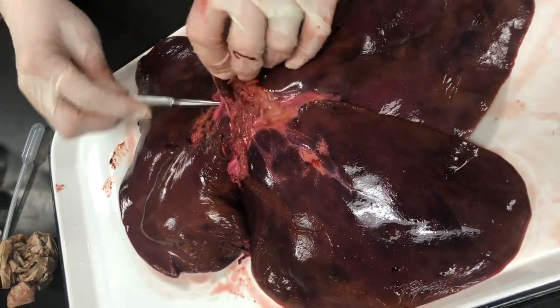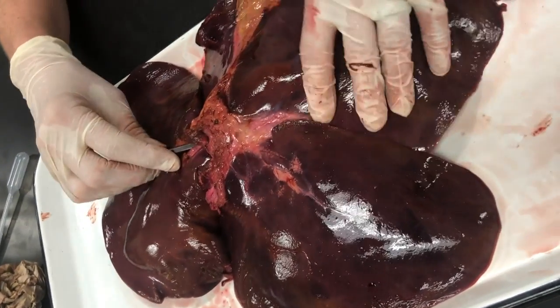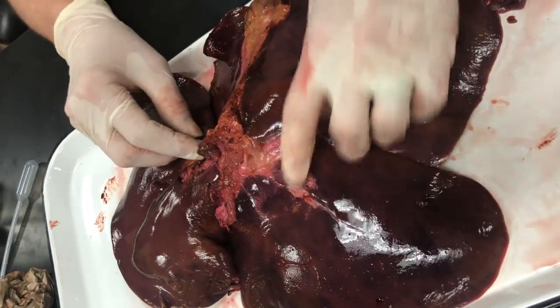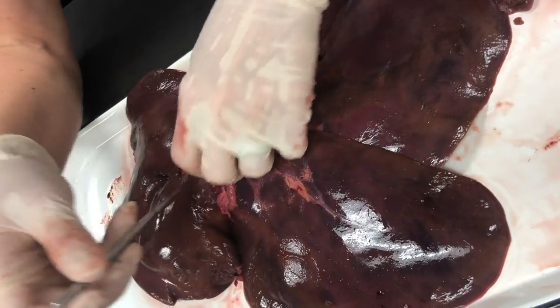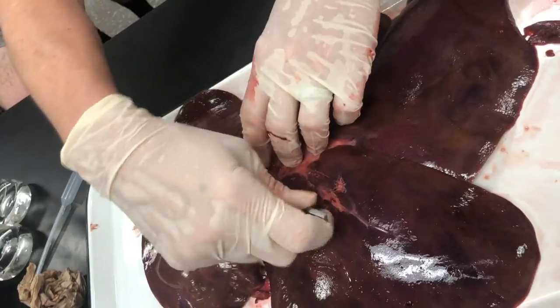Now look, if I poke around, the livers are maybe a little bit frozen, not tons frozen, and that might be better anyway. So I can get one to go into this lobe. I can get one to go into this lobe. Somewhere in there I can go into that lobe, and somewhere in here I can probably go into this lobe. So see how they have branches coming off?